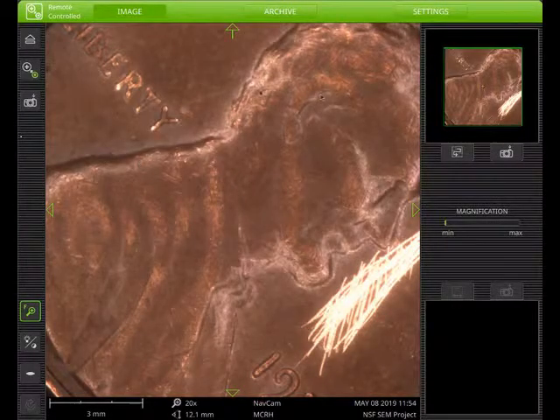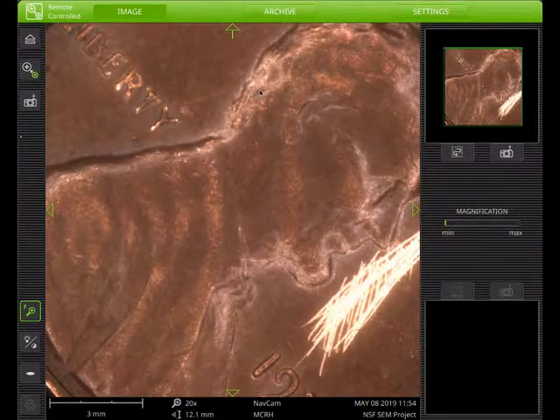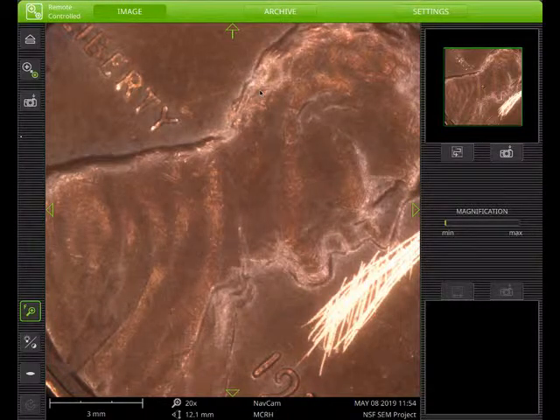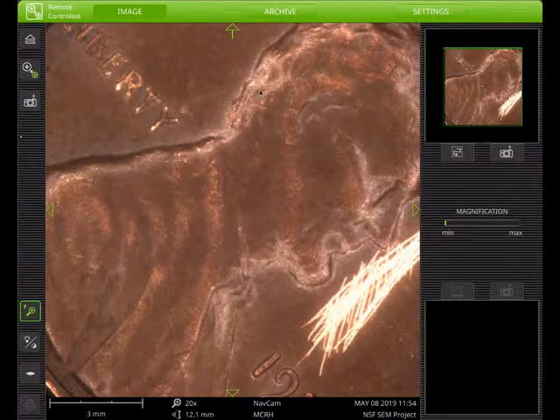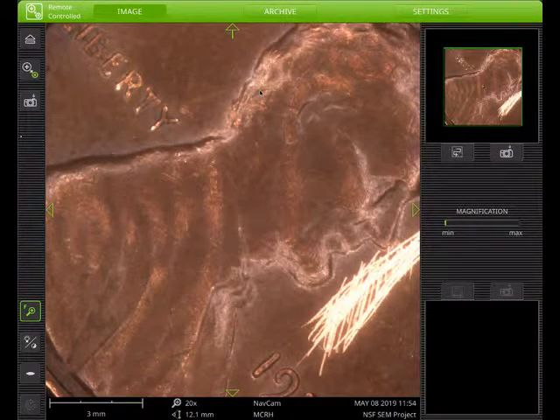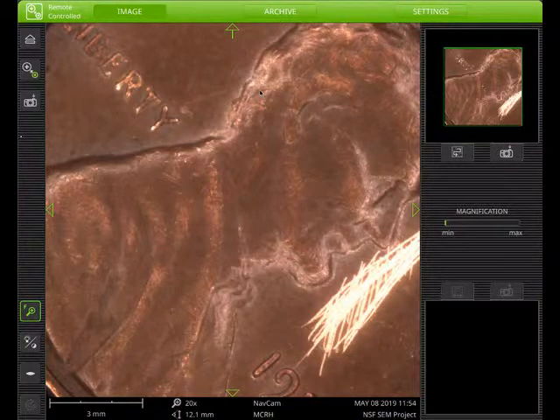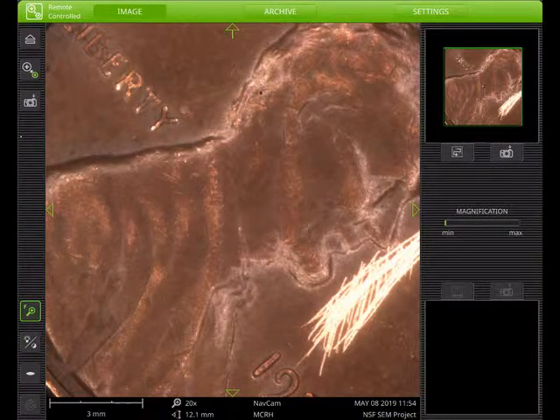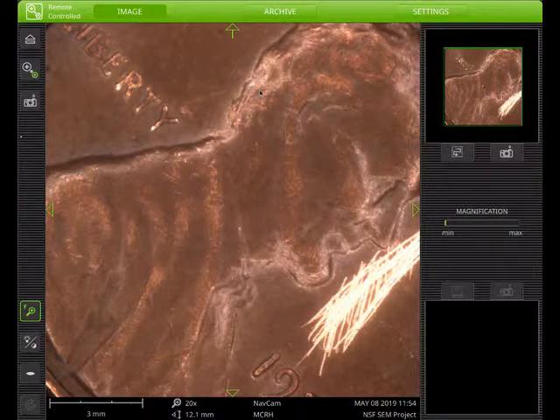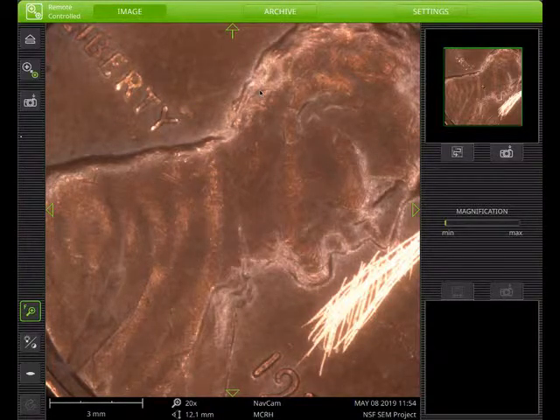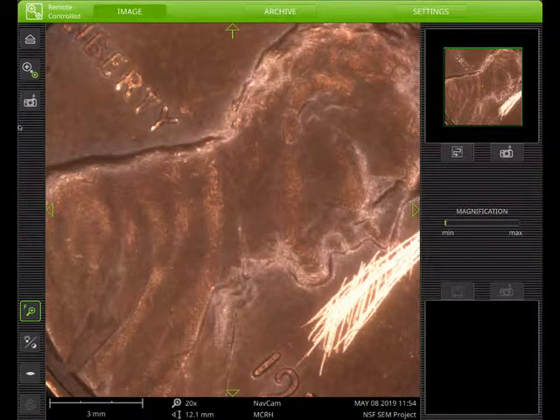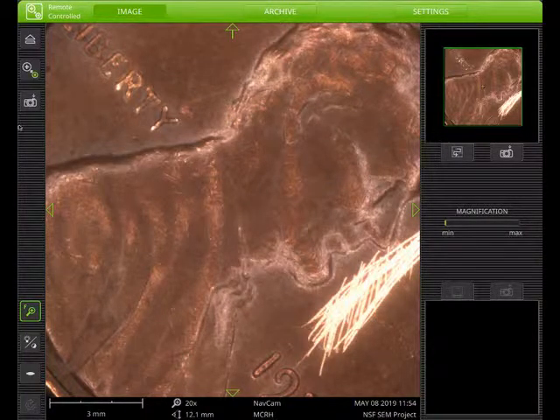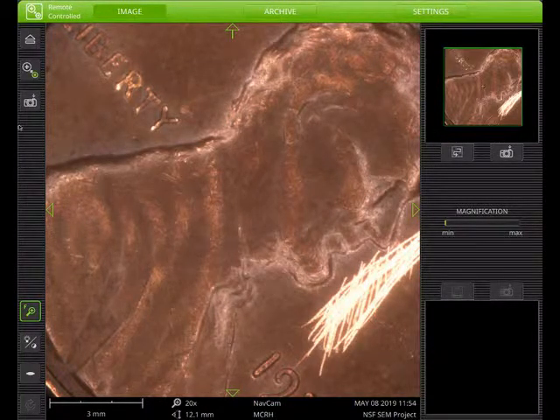Now we're looking at a penny which has been loaded into the SEM. It's been partially loaded in. That is, it was loaded into the sample holder, placed in the machine, the shield lowered down, and it has been brought into sort of the antechamber of the machine. It's an area inside the machine, it's not under vacuum yet, and there's a light microscope which allows you to image what you're seeing. It lets you get your sample oriented and get a sense of what you're looking at.